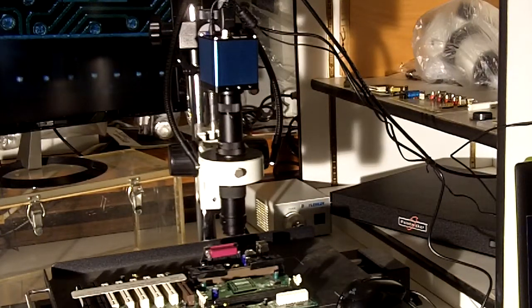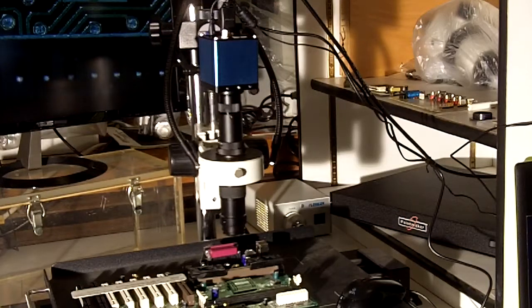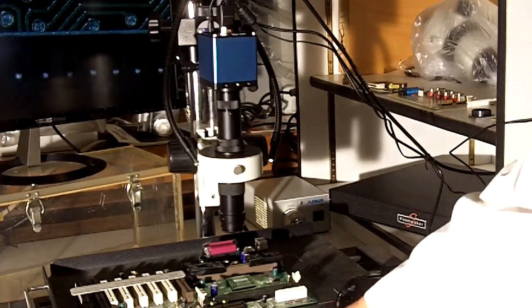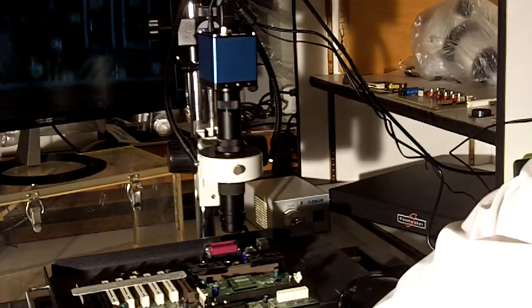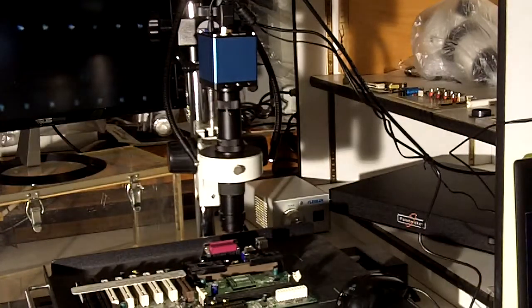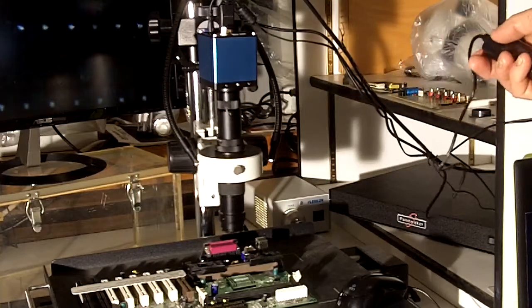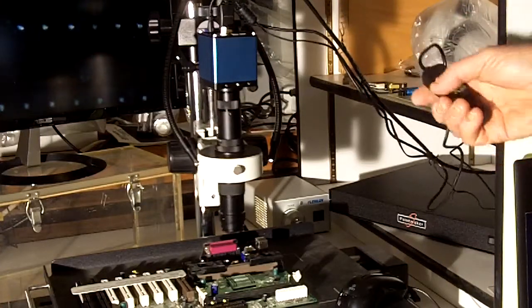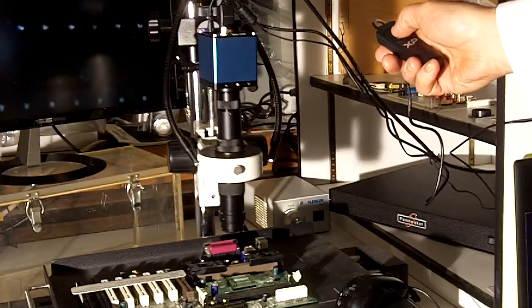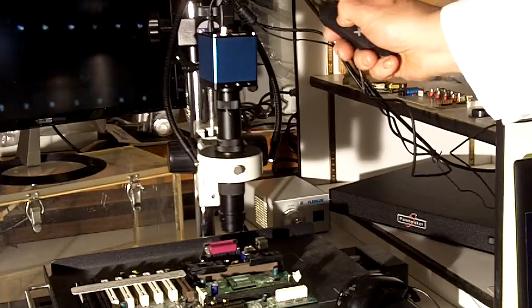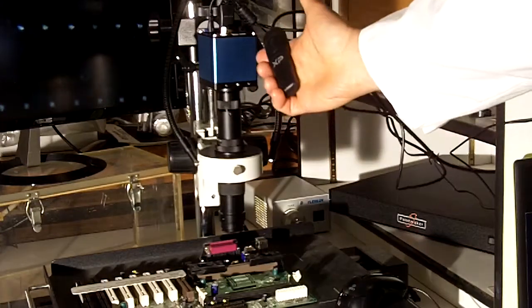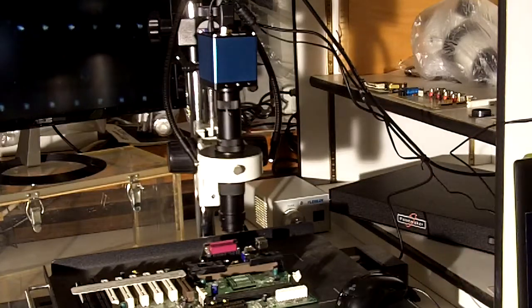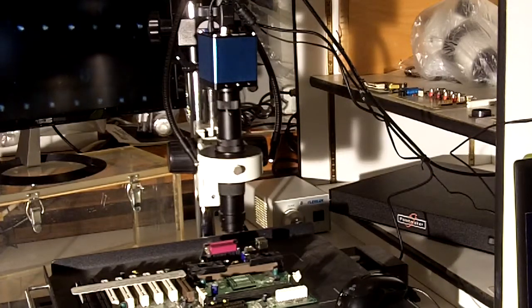We can not only do real time live broadcasts, here you can see us moving the sample, but we also have with this system a built-in SD card which allows us to take a photograph at any time just by pushing the remote tethered release that comes with the camera.